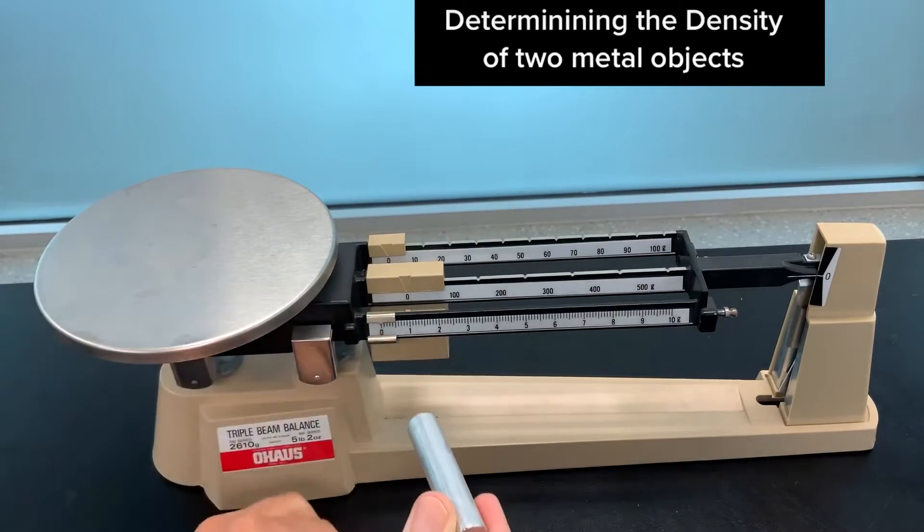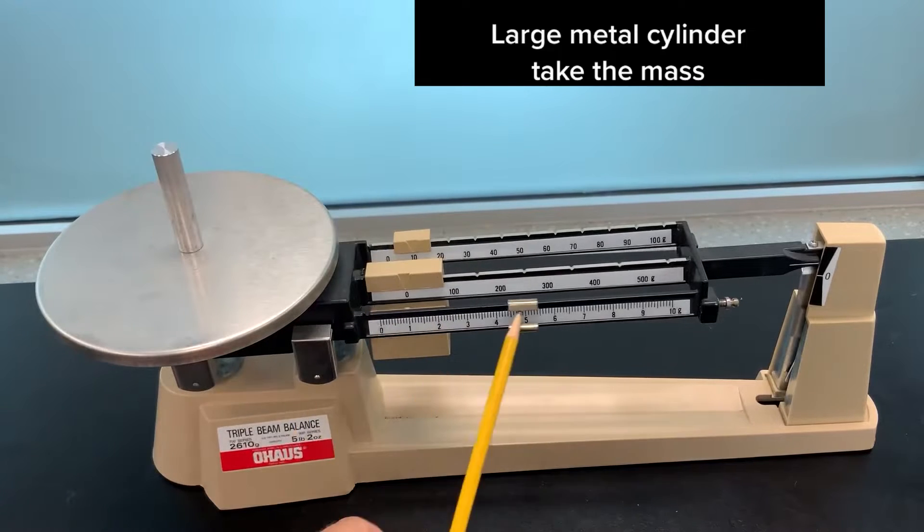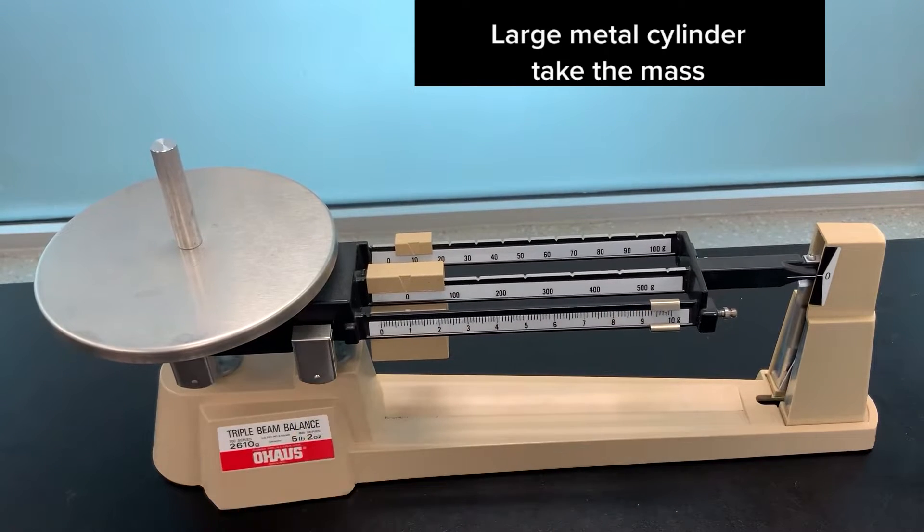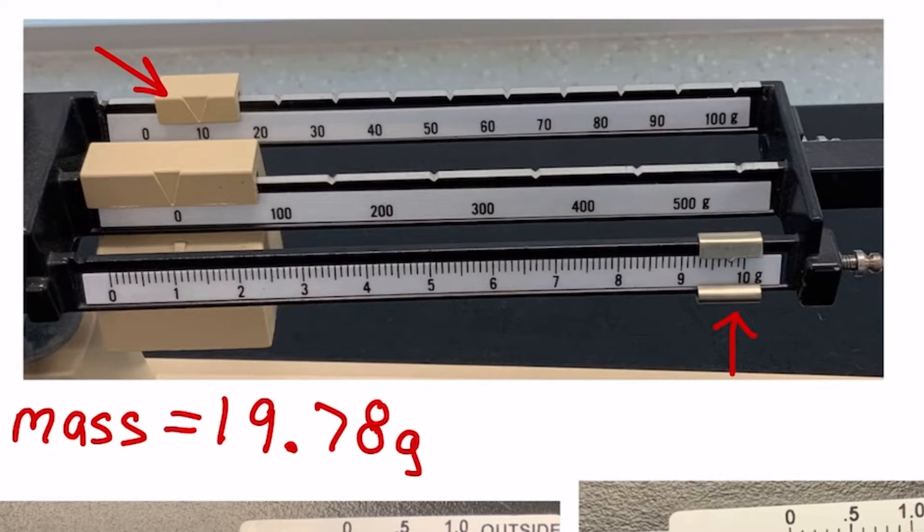Let's determine the density of these two metal objects I think are aluminum. First, the larger object. I'm taking the mass using a triple beam balance, and I find the mass is 19.78 grams.